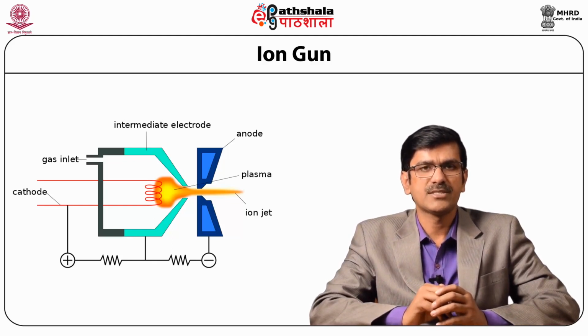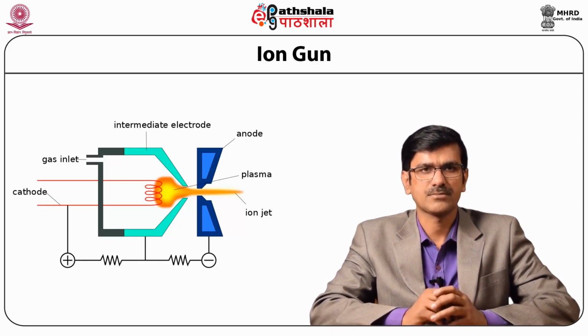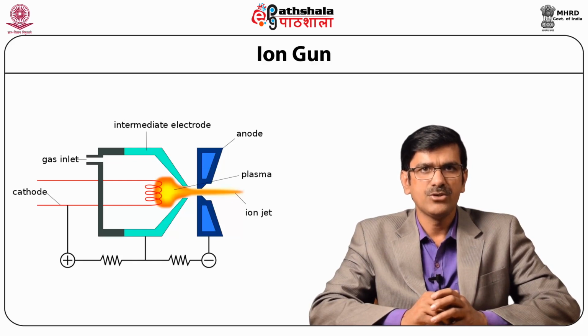The plasma is then accelerated through a series of at least 2 highly charged grids and becomes an ion beam, moving at fairly high speed from the aperture of the device. The duplasmatron design of ion source is sometimes preferred to remove materials and etch large areas rapidly.